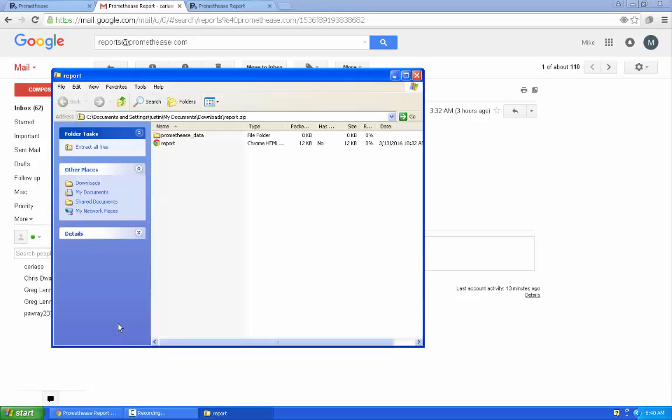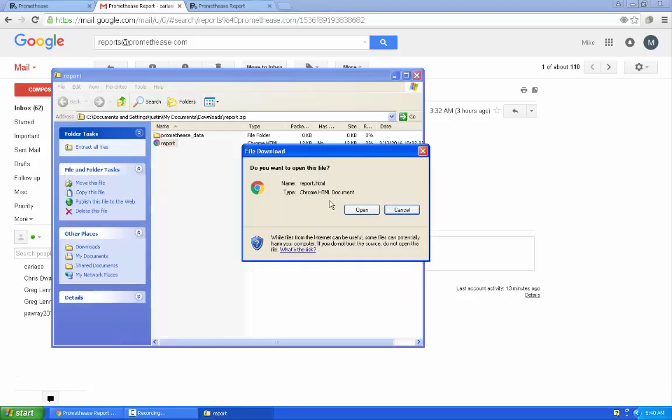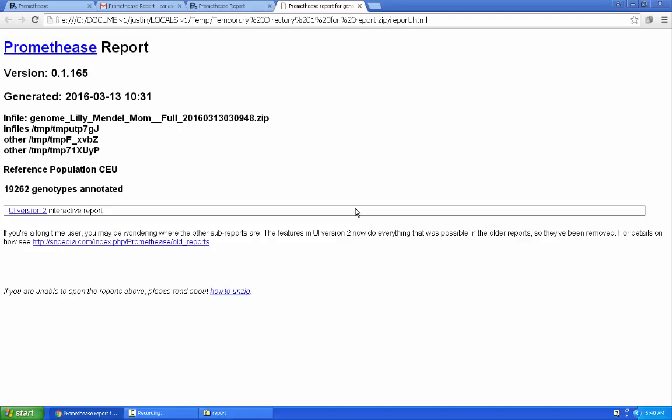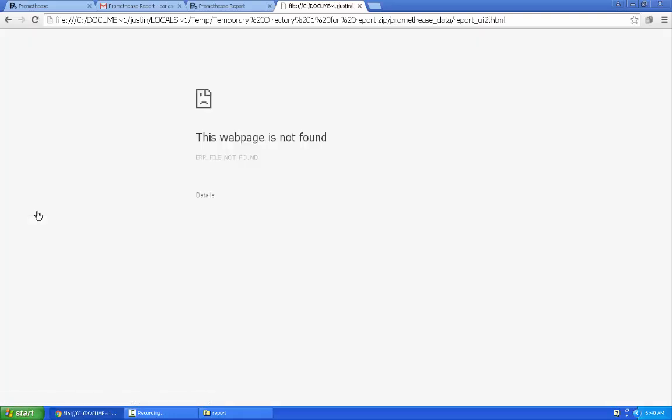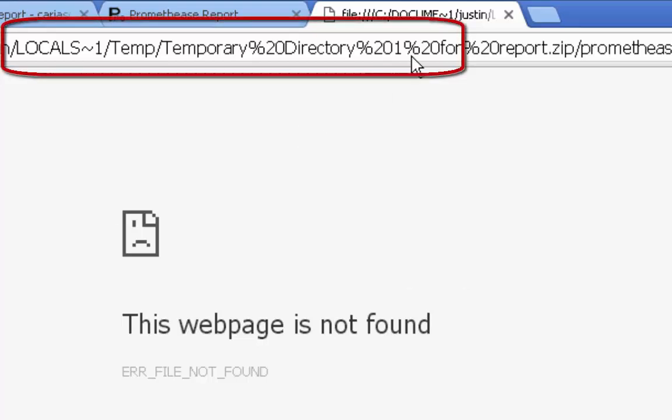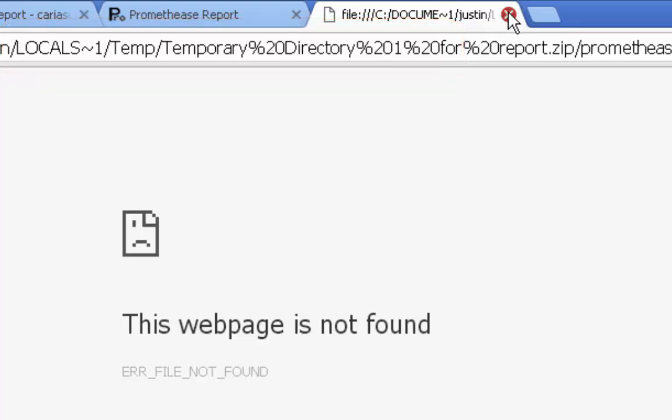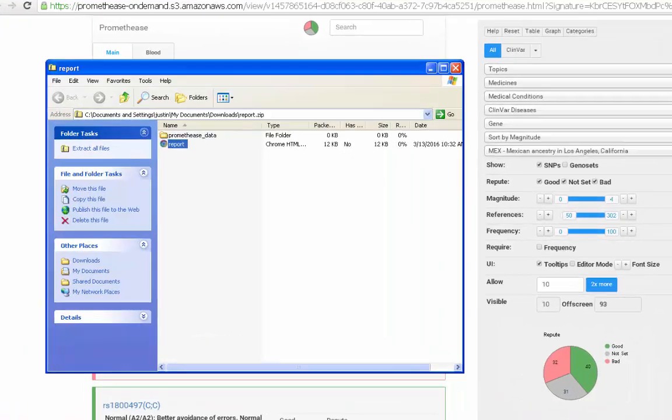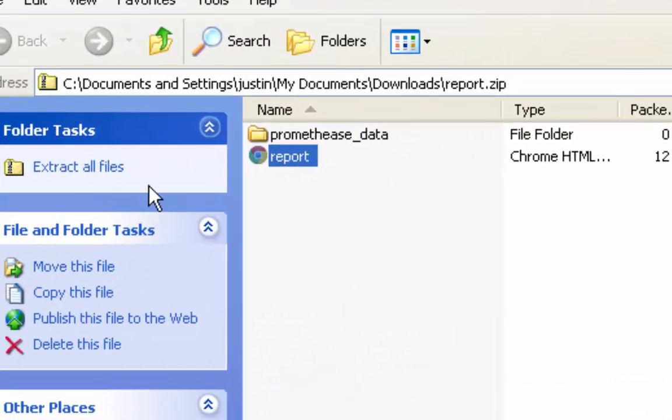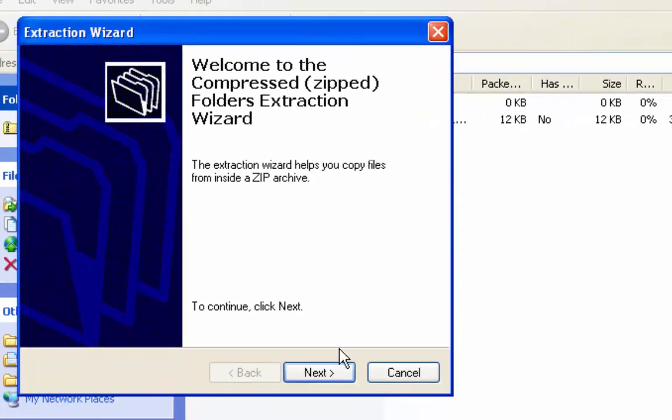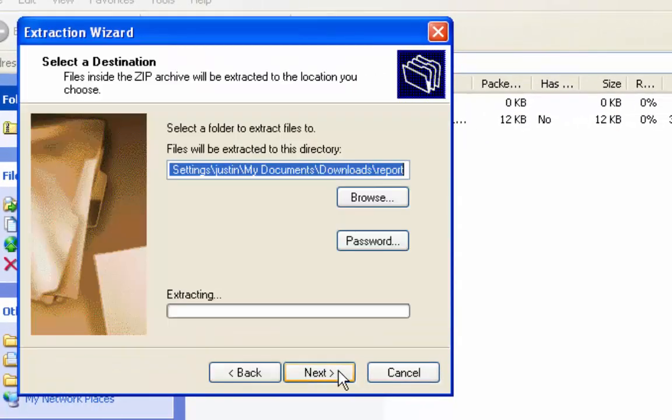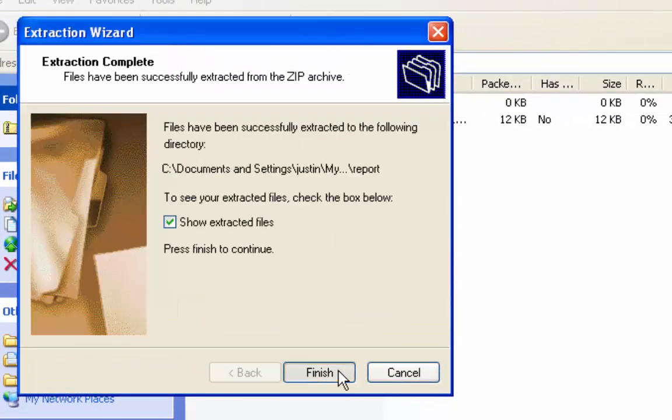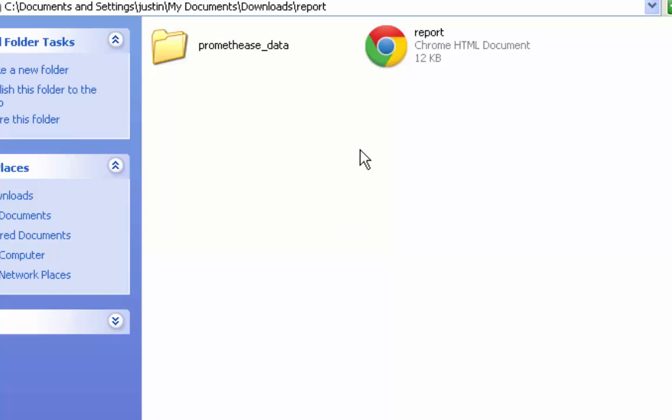Opening up this file is the major source of confusion for Promethease users, because sometimes you can see something like this. And the reason is that you didn't really unzip the file. Windows made it too easy to get one particular file out of there, but didn't unzip all the others. By clicking on Extract All in Windows, or different methods for different operating systems, you get all of the files really unzipped.